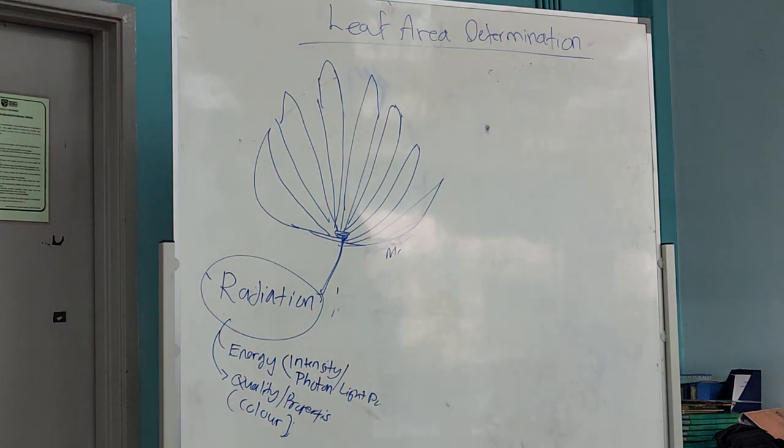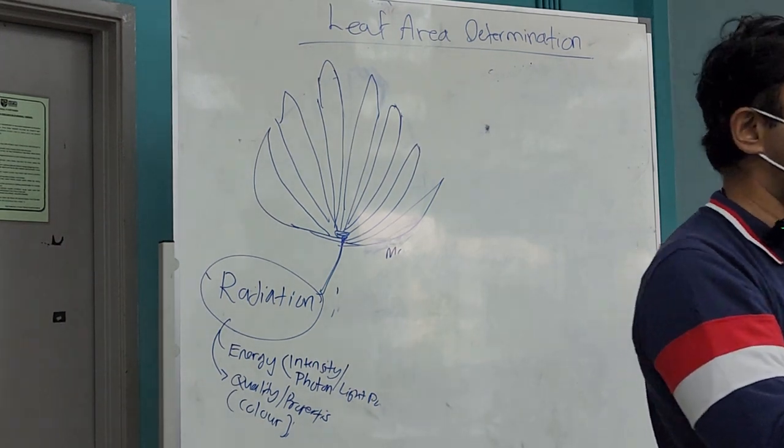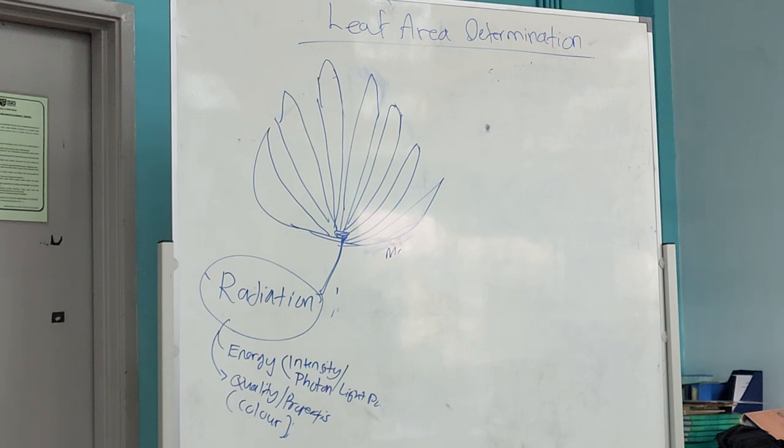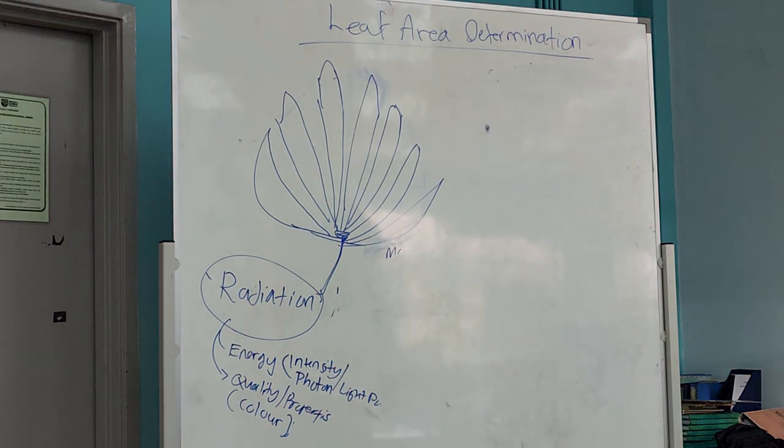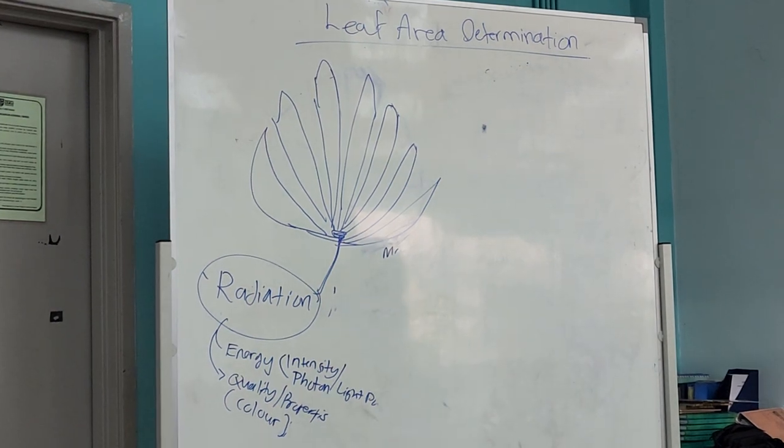Can I borrow a pencil? You can do the shading from the back. Look at this leaf. It's very hard to deal with, right? Because it's kind of overlapping. So the good idea is to remove each individual leaflet, and then at the end, add up everything together. So take one leaf. Don't throw it away. Then you can do the sketching, something like that, or the tracing.